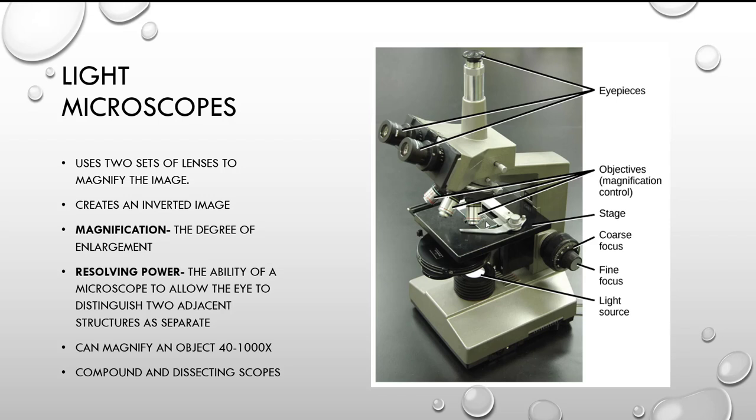So staining actually allows us to see individual organelles a little bit clearer, especially for cells that are more transparent. Okay, so that's something that we can do with our preserved specimens, or in this case, it's your cheek cells, so we just acquired it from you. So we can stain them to highlight certain parts.